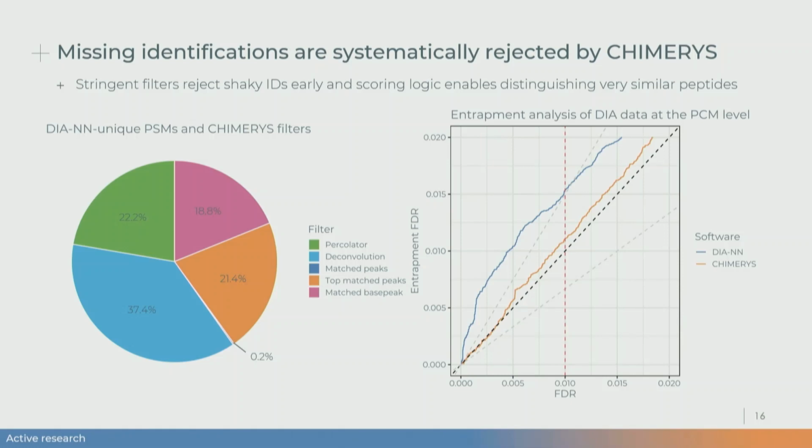And as you've seen previously with wide window data, also in DIA data, we are pretty spot on. I should mention at this point, this is a very hard case. 9-fold shuffled sequences, those are very, very similar. You will very likely not encounter this when you normally analyze your files. So this is a very synthetic type of experiment.